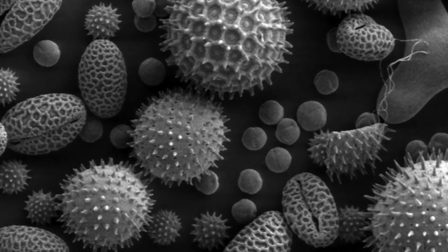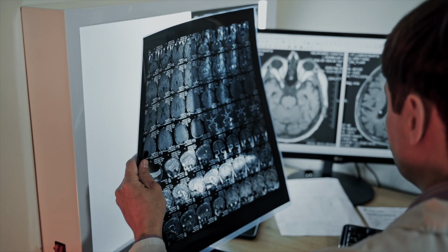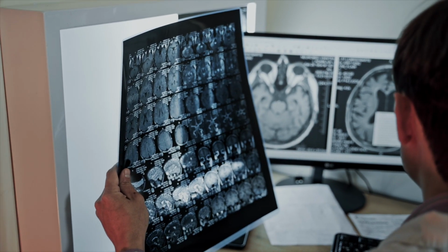A challenge in this field is that these pictures from electron microscopes look quite different to what natural photographs look like, so we have to come up with specialized solutions in computer vision to handle this task. People have built foundational models for natural images, but we do not have that for electron microscopy, so we are trying to build one for electron microscopy because we have got so much data to play with.